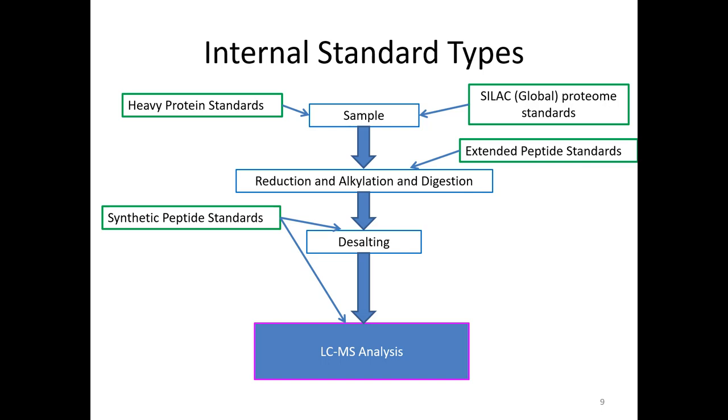And so that means your heavy protein isn't 100% pure because it doesn't have all N15 at every single atom. And so that just makes it a little challenging because you kind of have to multiply the incorporation by all of the nitrogens in the system and in the protein. And so you don't always get anywhere near close to 100%.